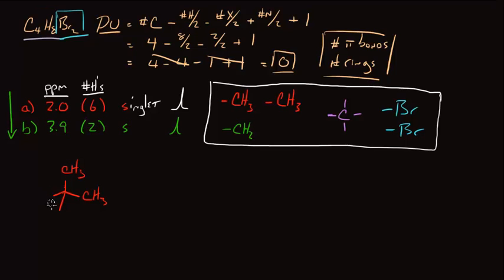So we can redraw this part of the molecule like so. We'll draw a carbon in the middle, and we'll show it going to the 2 methyl groups right here. So we've taken care of this quaternary carbon. We'll show the other bonds. And we've also taken care of the 2 methyl groups right there. So those are used up, and the quaternary carbon is used up.